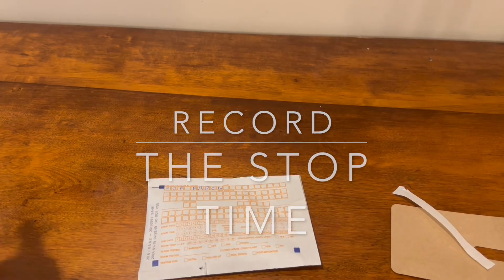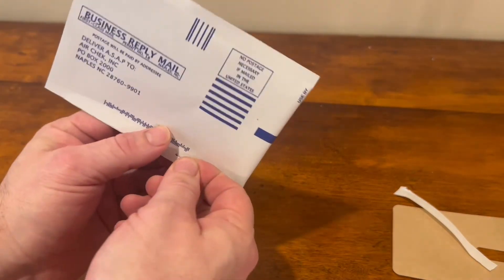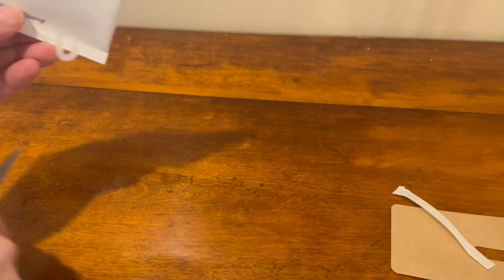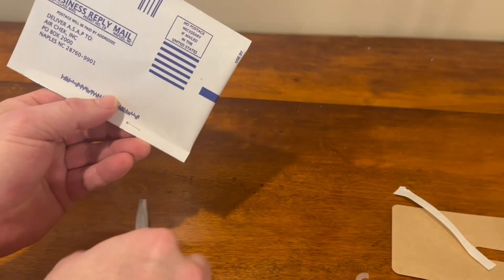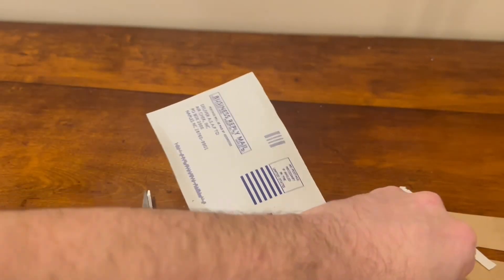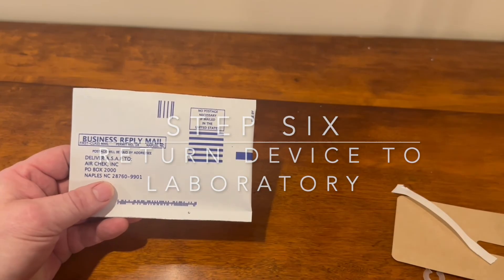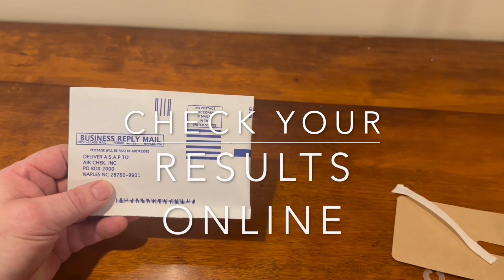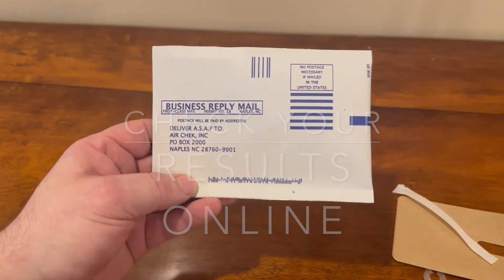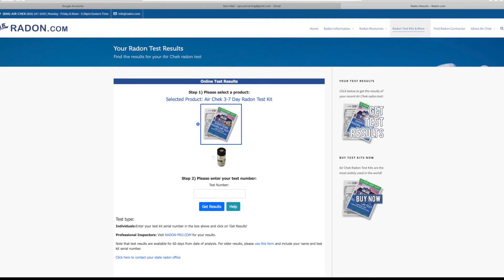Make sure you've recorded the stop time on the packet and at Radon.com where you've registered the device. You are now done and ready to return the sealed packet to the laboratory. To review your results, scan the QR code again or visit Radon.com and look up your test results online.